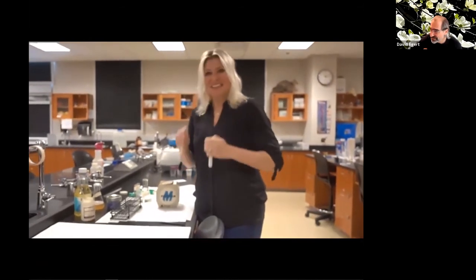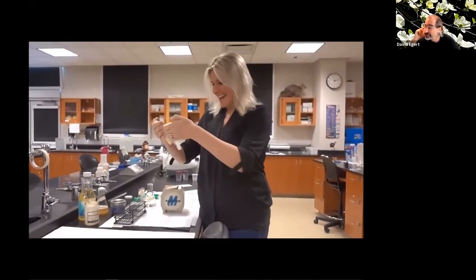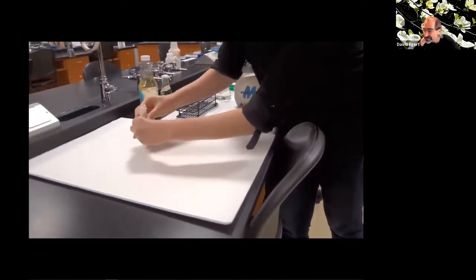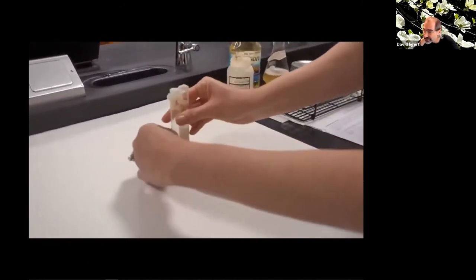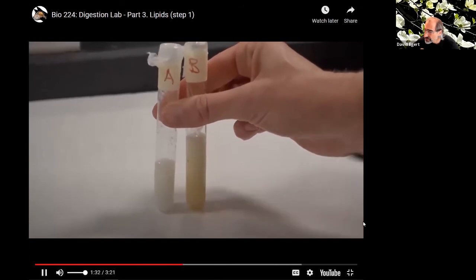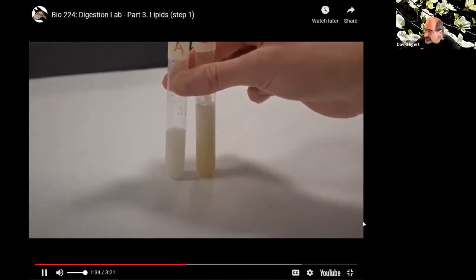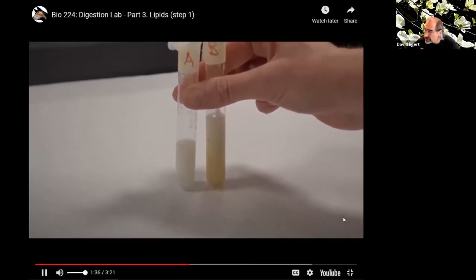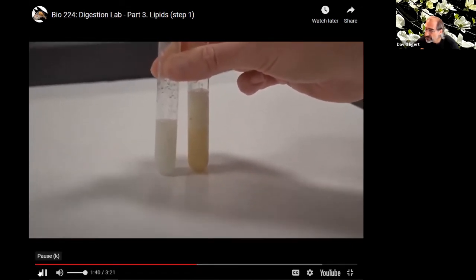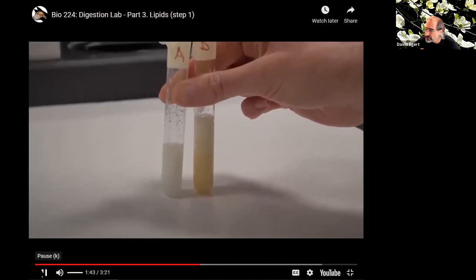We shake for 30 seconds, and then we're going to just stop. So I'll show you test tube A and B here, and we can compare them right after I've been shaking. Test tube B has bile salts in it. We're now going to observe what happens over the next couple of minutes and see if we can get the oil and the water to separate out.